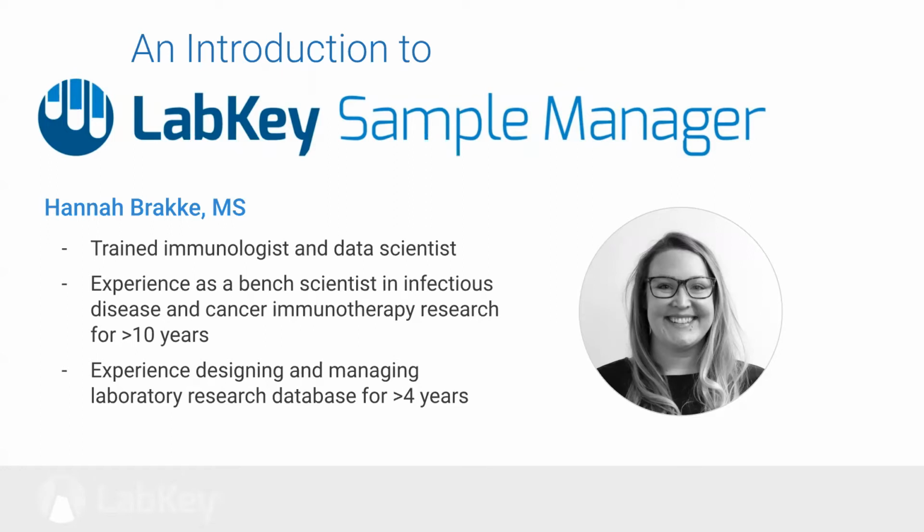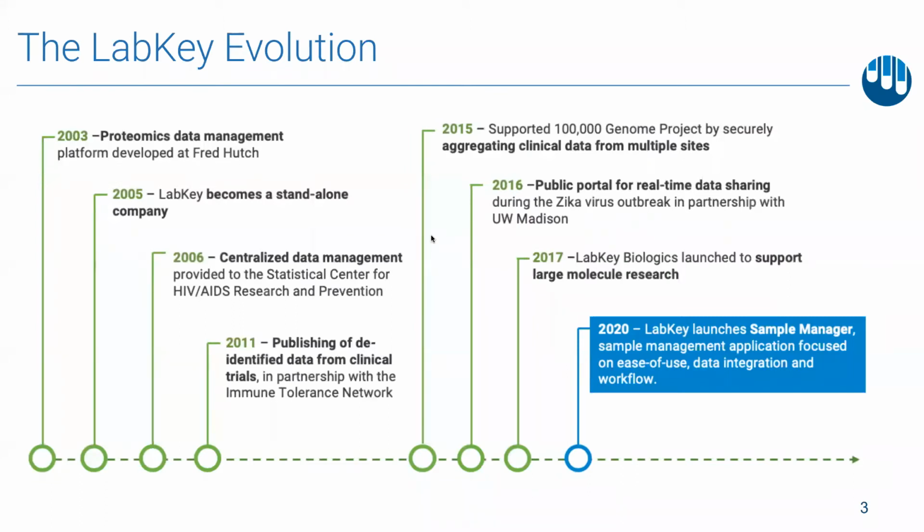So I'm going to start with a little bit of background on LabKey. As some of you may know, LabKey has been building software for scientific data management needs for over 15 years. We started out as a proteomics data management tool at the Fred Hutch in Seattle. After a couple of years, the founders of LabKey understood how important it would be to create a standalone platform that would continue to grow and be supported.